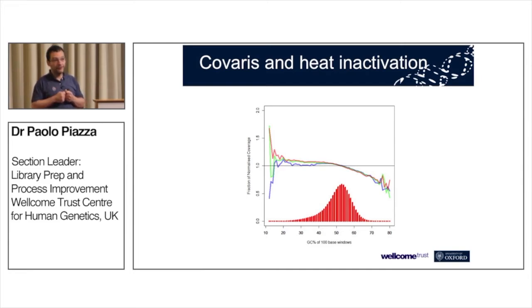And this is quite important for pathogens that grow very slowly, like TB. It takes weeks and weeks. So if you can reduce the time from sampling to DNA that can be sequenced, that would be quite useful to the clinical community. So we have these two kits which we're trying to figure out how to combine eventually.